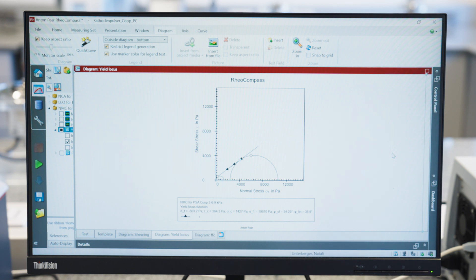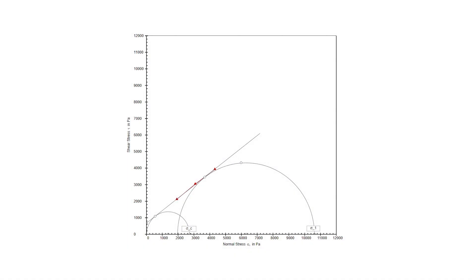These three shear to failure points, which are automatically identified, are then used to calculate the yield-locus function, which is the straight line in this graph, and the Mohr-Coulomb stress circles. These circles provide important information about the minimum normal stress required to make the powder flow at this defined state, which is sigma-C in the graph, and about the total amount of stress present in the system, which is sigma-1 in the graph.